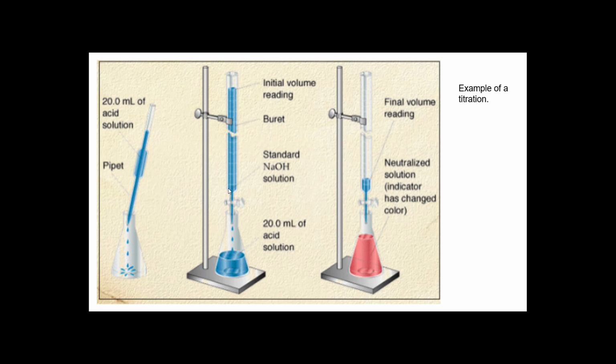Here's a picture I found, just a general picture of the steps that you would do for a titration. It starts out with one color, then changes color. You can see the base is still blue, but this is a red. Don't worry about these volumes. You're not going to use these volumes. Take everything off LabFlow.